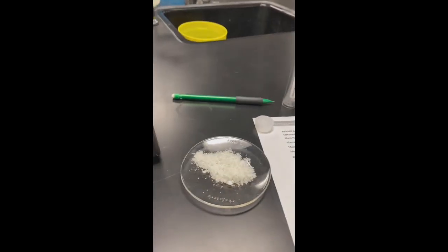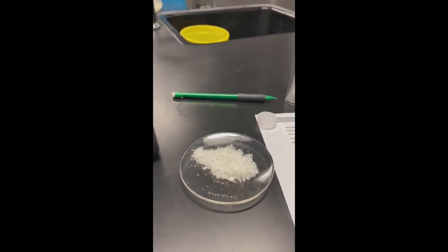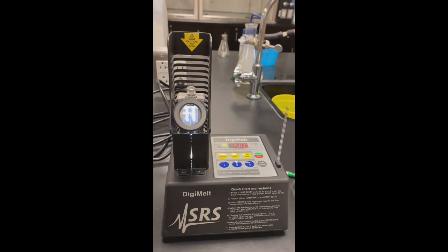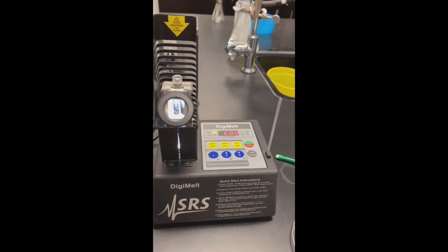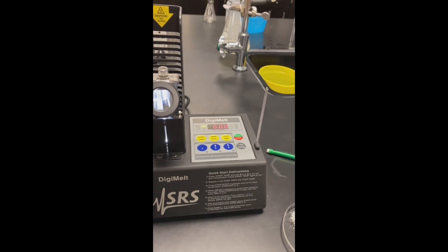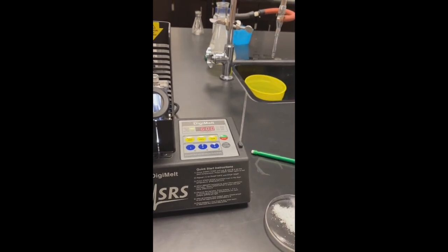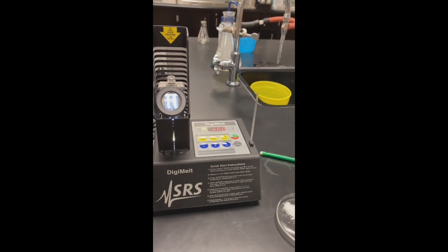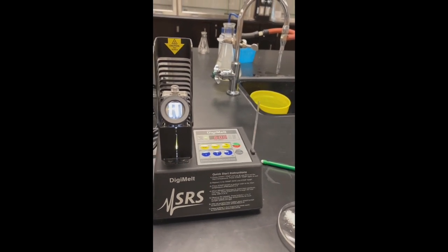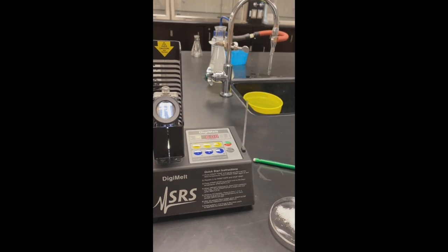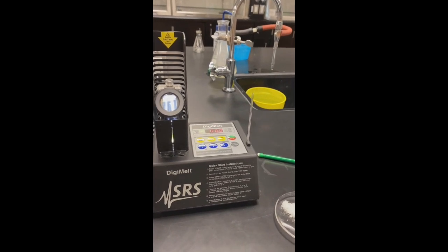We're going to take the melting point of our product here. I'm going to be using the Digimelt apparatus. I started it at 60 degrees, and I have the ramp rate at 2 degrees per minute. What's going to happen is I'm going to get the melting point range, and I'll be giving that to you. The technique I used is exactly the same technique we used in Experiment 1, and I'll come back with you with our range.